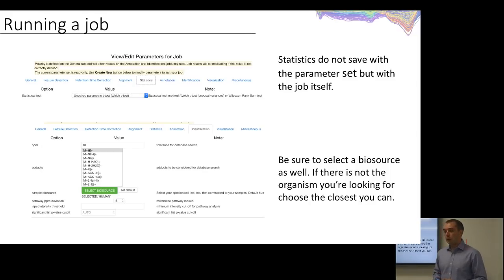The other thing to remember is that if I pull this back up, as some people have done to check that the system took it, it will reload the default, and you will lose the statistic type that you just put in. So just know that it has taken that statistic type, and don't try to check it, because you'll just go into a constant loop.